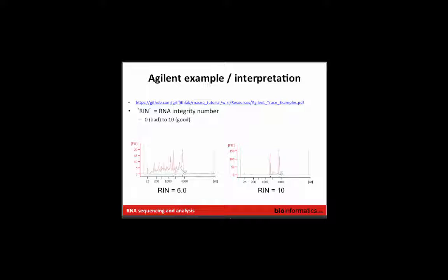The one downside is that you lose the ability to do all of the other analysis applications beyond differential gene expression. You might think that you don't care about those things now, but you might change your mind later.